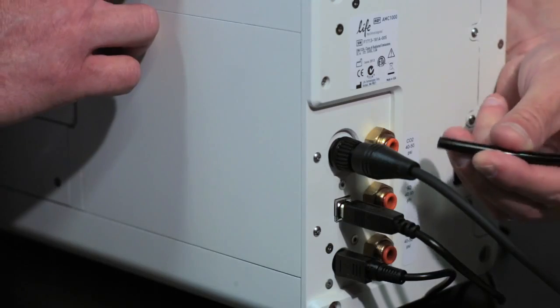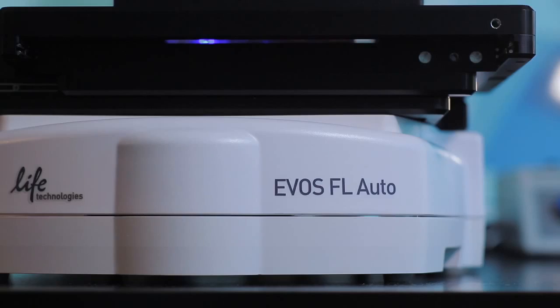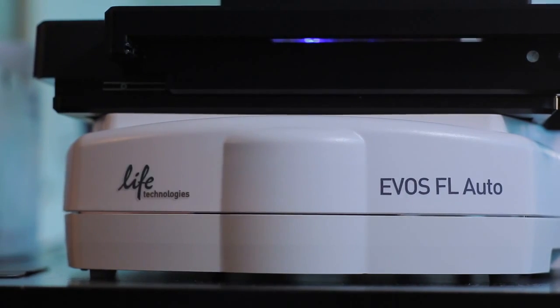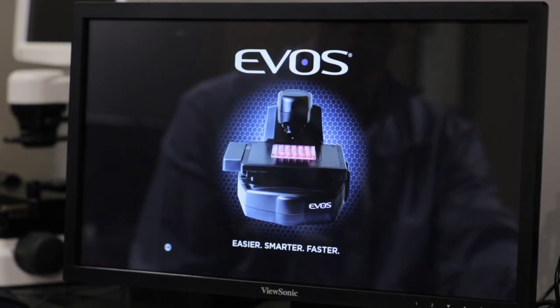If you are using a premix gas tank of compressed air and 5% CO2, connect the tubing to the air intake. Turn on the system in the following order: first, the base unit of the EVOS FL Auto System; second, the On-Stage Incubator Control Unit; and finally, the EVOS FL Auto software from the computer.